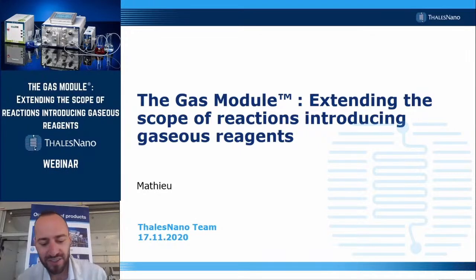Welcome everybody to this webinar, or welcome back for those who have followed the previous webinar. I am Mathieu, an application chemist at ThalesNano, and today's topic is the gas module and how you can use it to extend the scope of your flow reactions by introducing gaseous reagents.